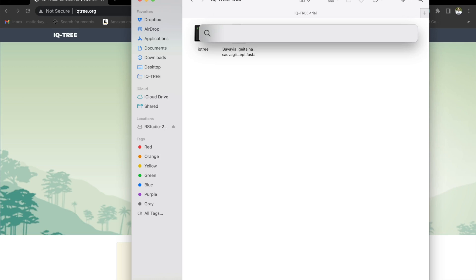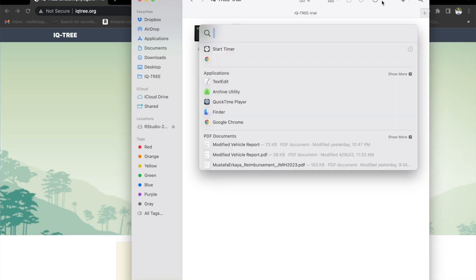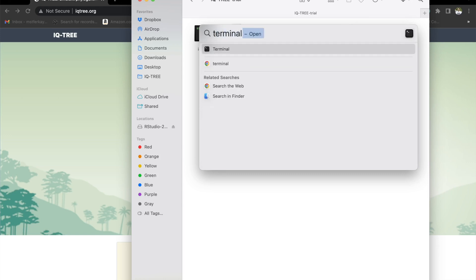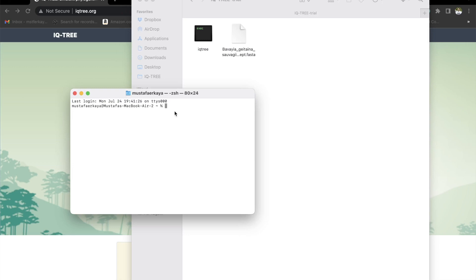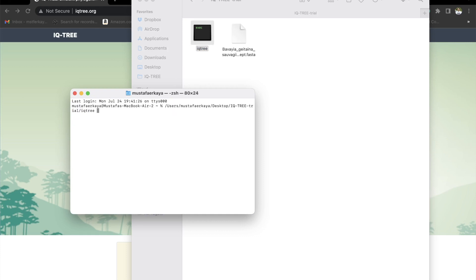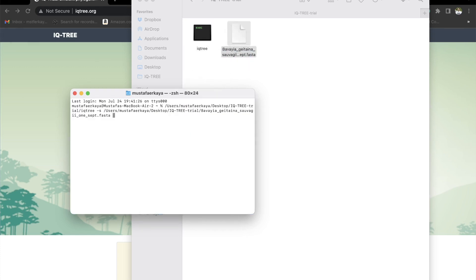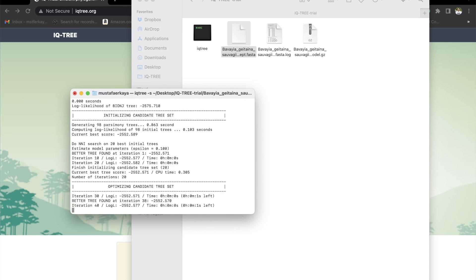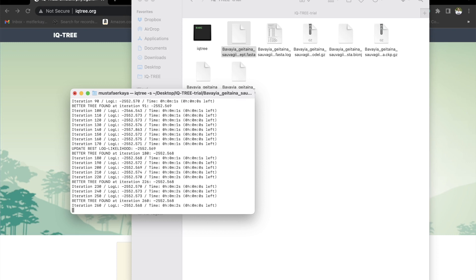Let's go to the top right corner and find the terminal. This is the command screen we have. What we're going to do is actually pretty simple. Drag the IQtree to right here, leave a space, type in -s, and then drag your file. Then type in -m MFP. When you run this code, it's going to start analyzing your FASTA file.